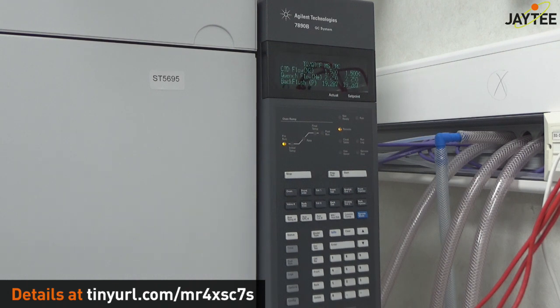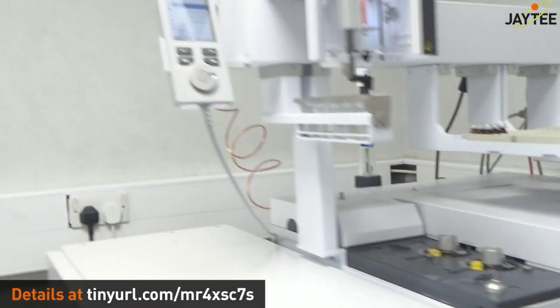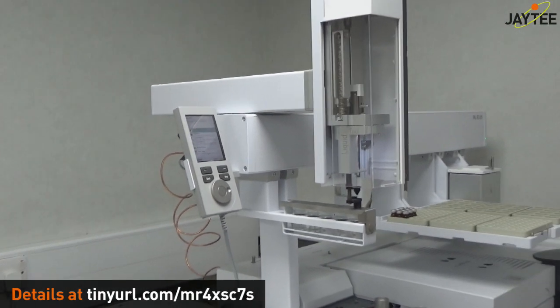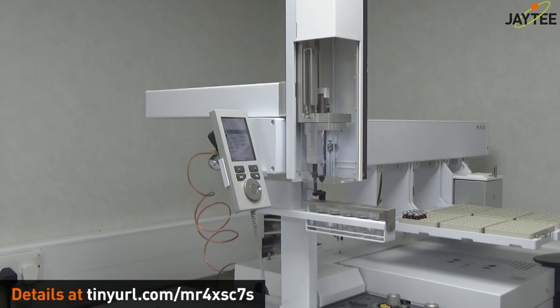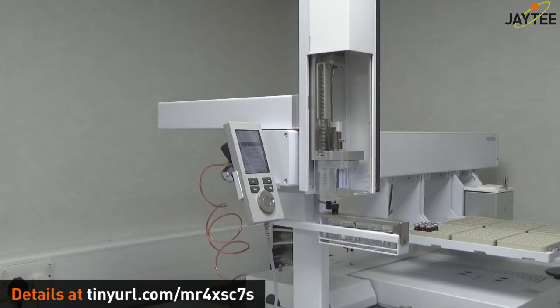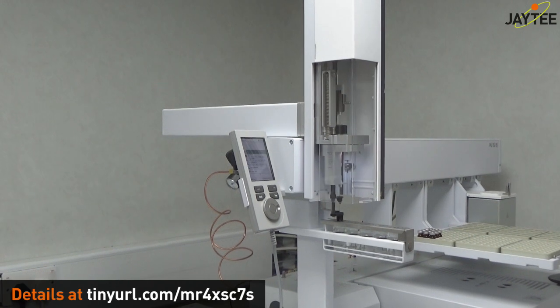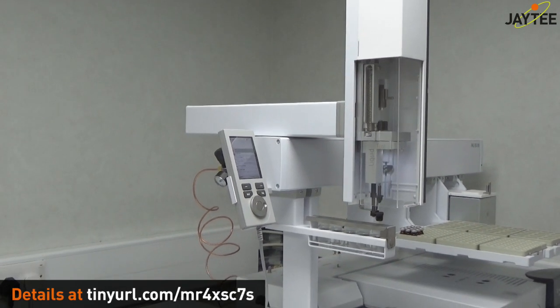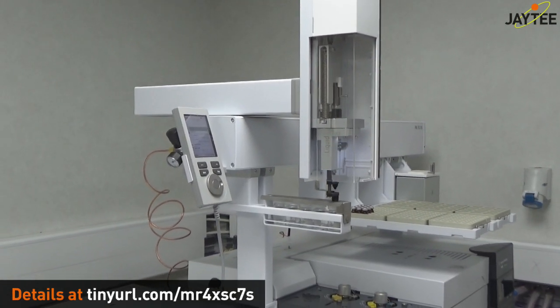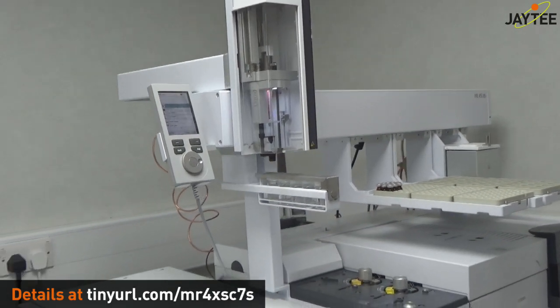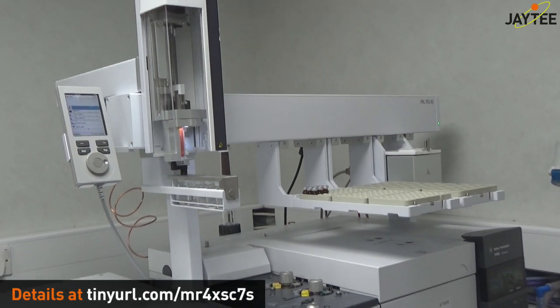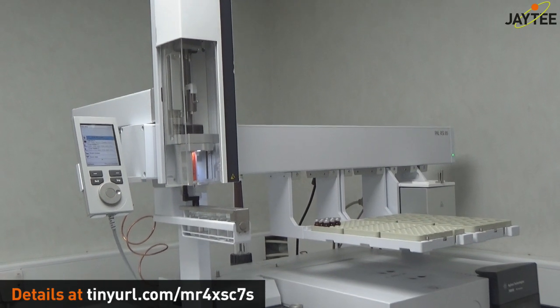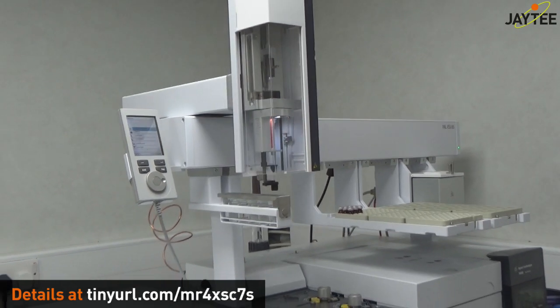So we've now got it connected to the PAL RSI 85 injector. And this is set up for normal vial injection but also if you look in the far right hand side there's also the headspace unit on there as well.